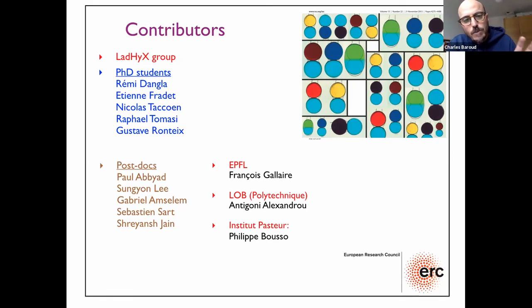But the other game that we can play is to actually remove the oil by gelling the droplets. You can actually remove the oil and replace it with an aqueous medium, and there you almost have the same optical index. So you can improve the quality like this also. I see, to match the index. I see. Cool. Very cool.